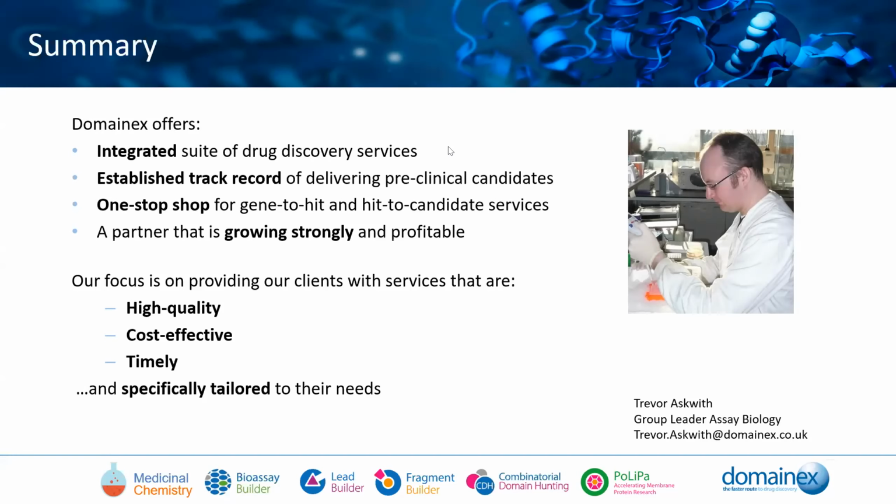We go through quite a thorough assay development program for our MST. For example, we'll run a buffer screen, which is particularly useful. The biggest problem with most of them is needing a good quality tool compound. That's always the challenge when projects come in where you don't necessarily have good quality tools or any tools whatsoever; that becomes more challenging. But so far, we've managed to develop assays and hits for, if not all, very nearly every single MST assay that's come in.